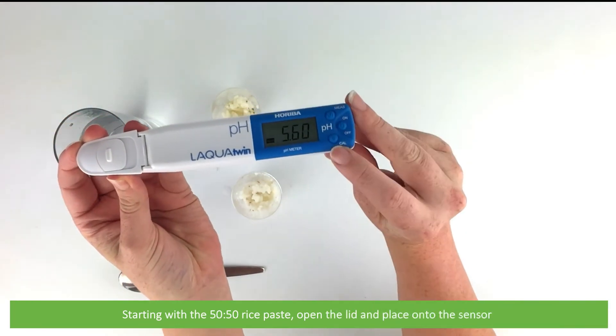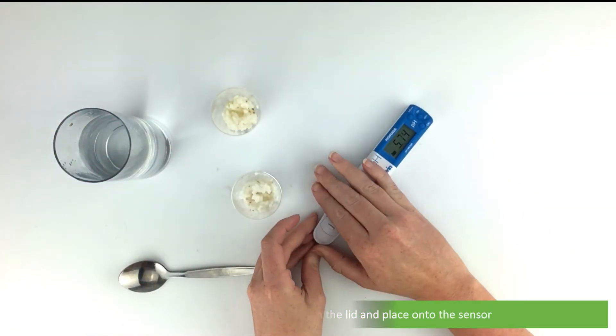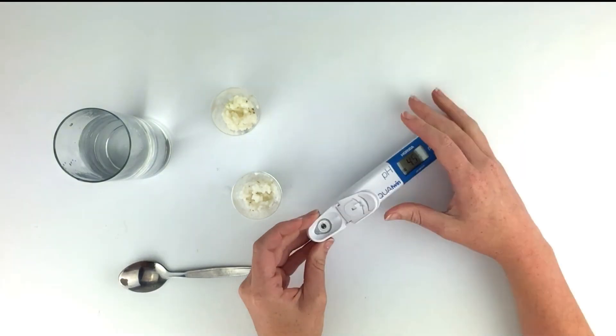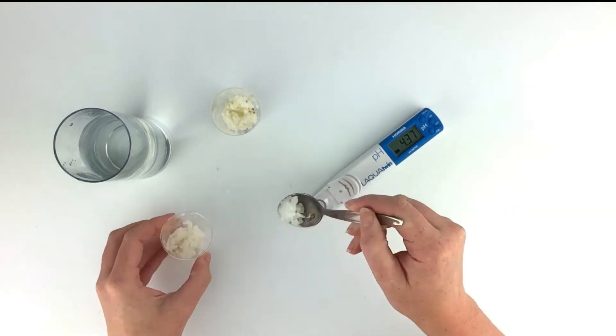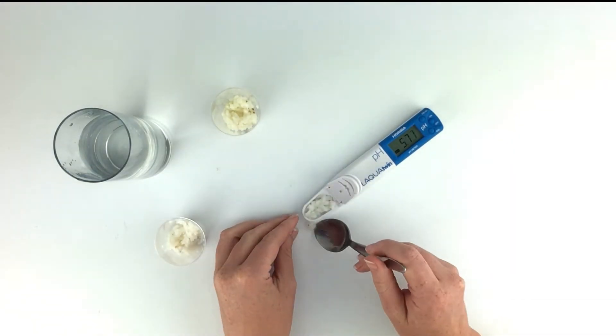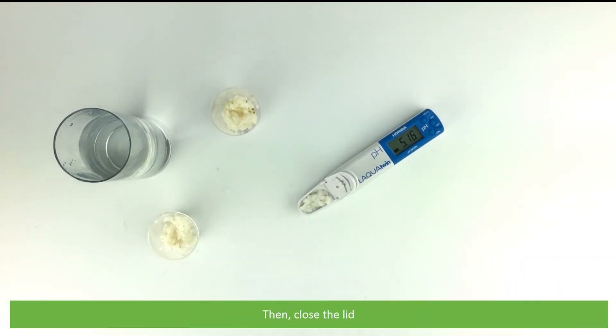Starting with the 50-50 rice paste, open the lid and place onto the sensor, and then close the lid.